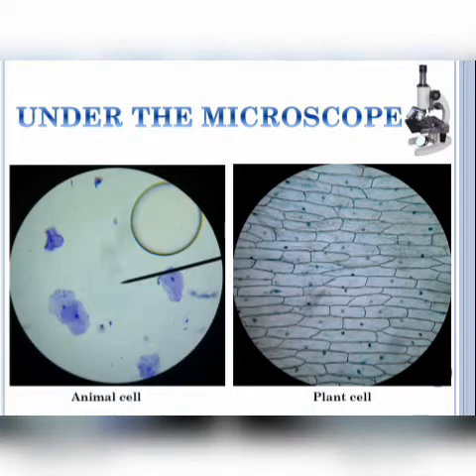Microscope contains multiple lenses which helps in collecting light from the object and then in focusing the light into the eye. Microscope has the power to magnify very minute objects to a considerable size, giving small to smaller details.